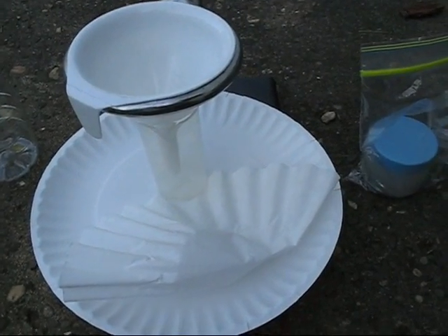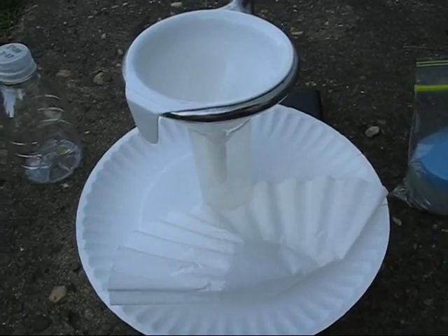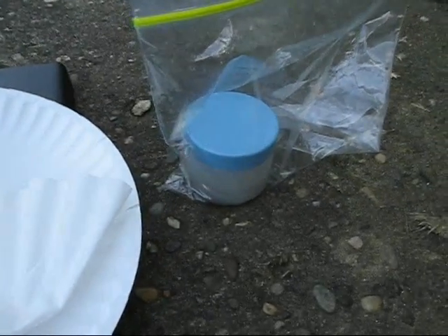Hello, everyone. It's the next day. My neighborhood's very noisy, so I hope you can hear me, but I'm going to clean my mercury.